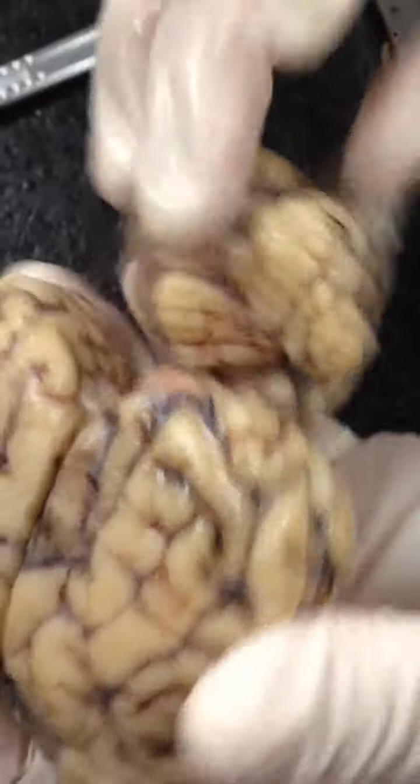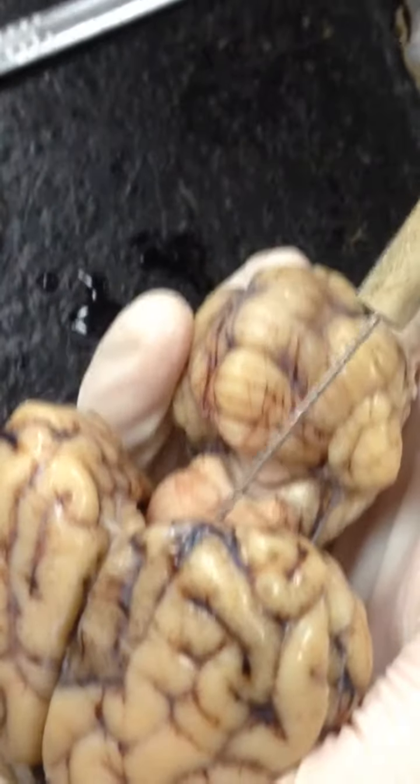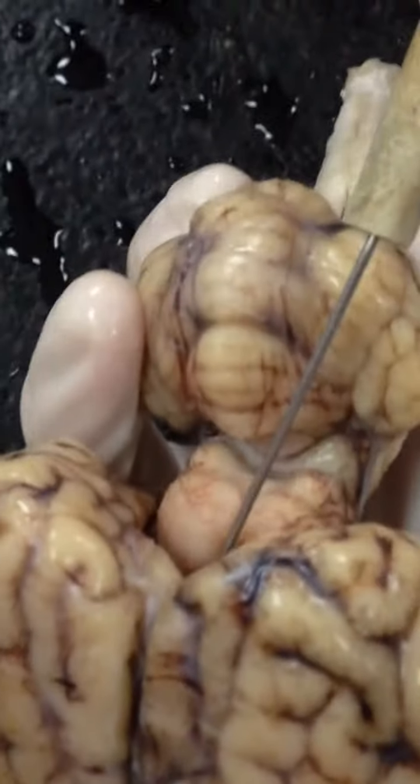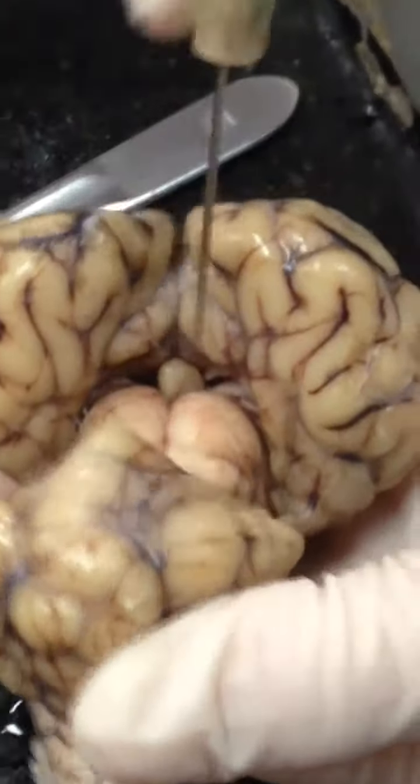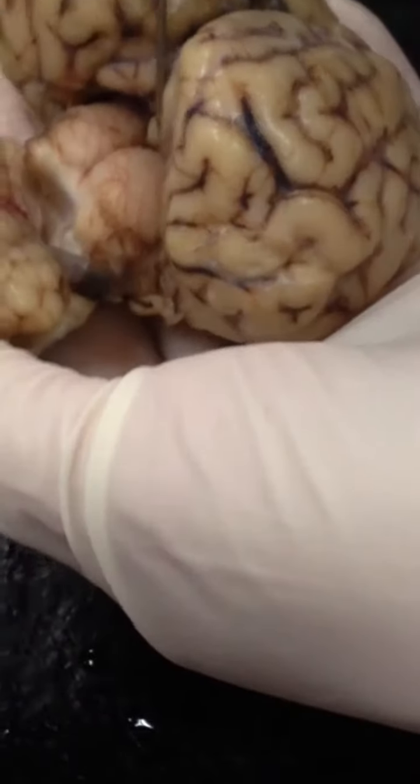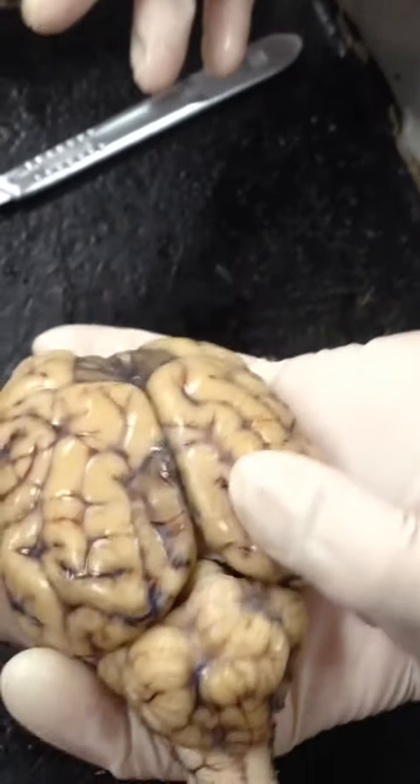Above that, if I bend it back, you see that little ball structure up there? That is your pineal gland, okay? I'll turn it around. Pineal gland, up here, this little ball structure right here, okay? I think that's all you have to know from that view.